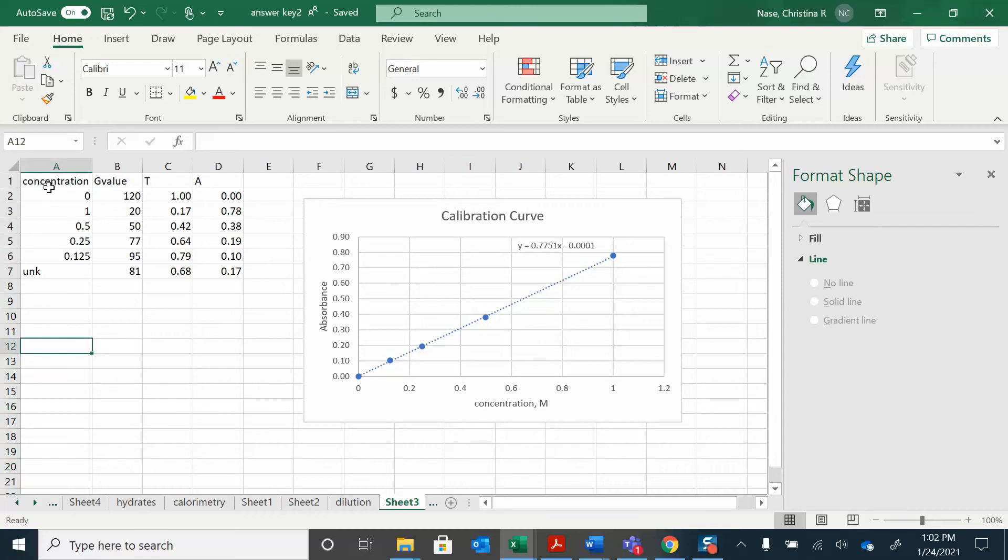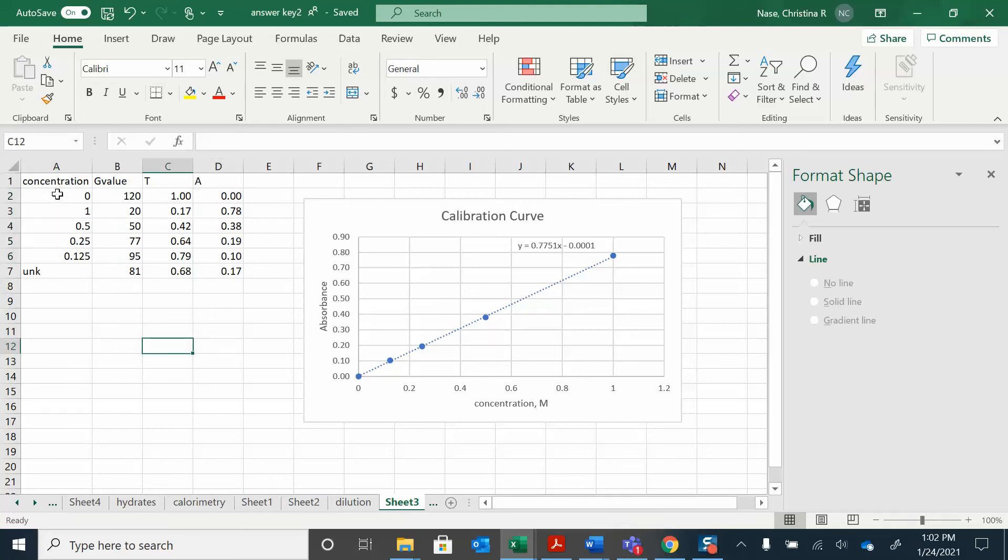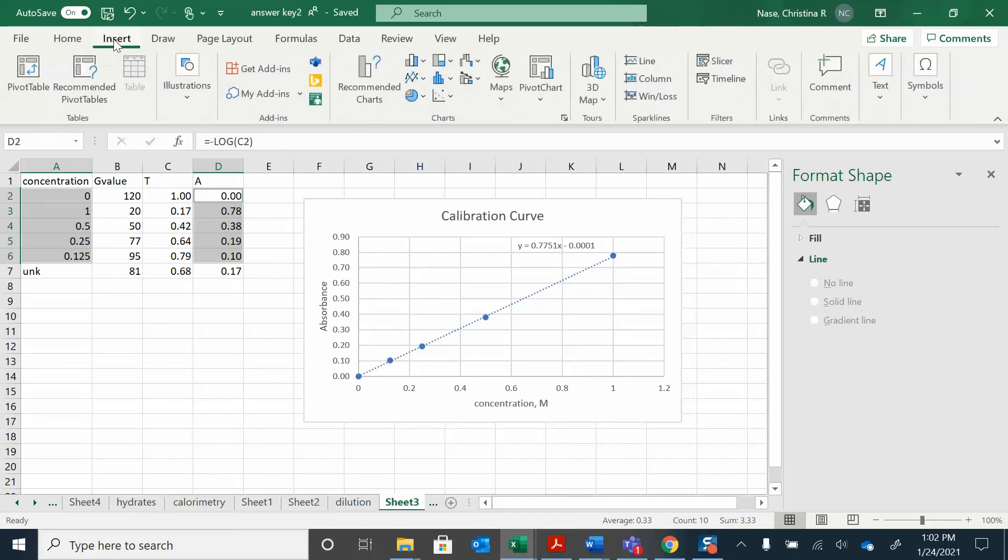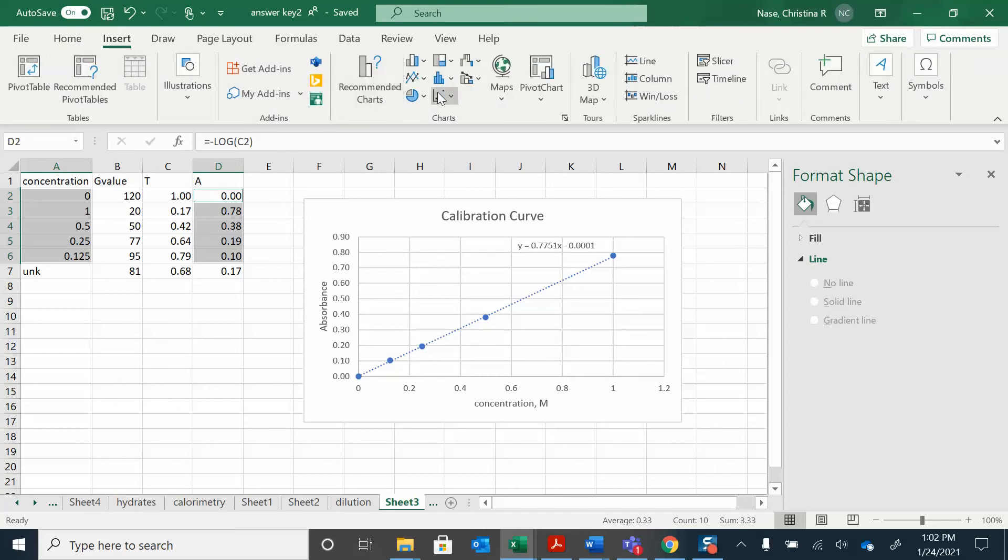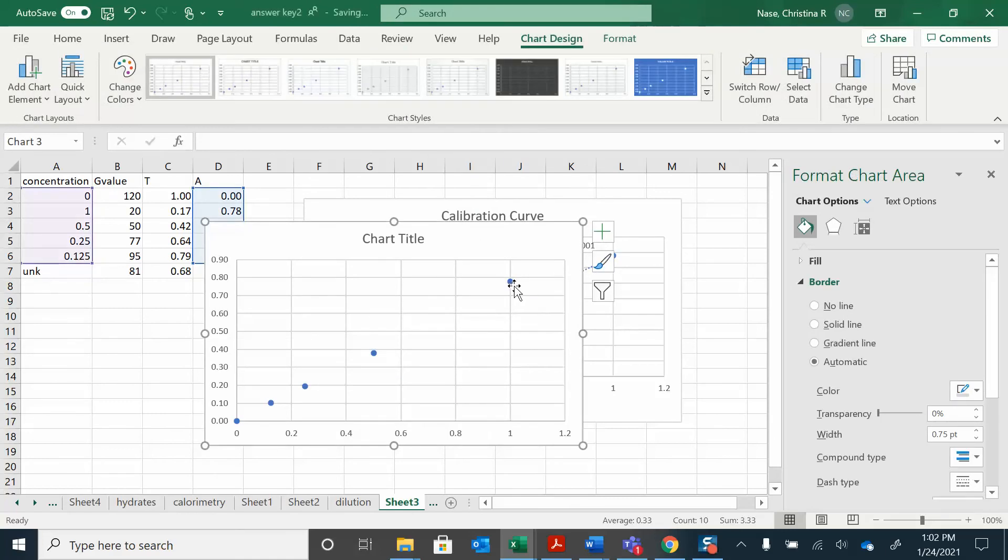So again, all I had to do was highlight those two columns, highlight this, and then control here. Highlight that. Control that. Make sure you leave out the unknown because you don't know what that concentration is. It's going to give you an error if you try to plot that. Then go to insert. Charts. Pick a chart.